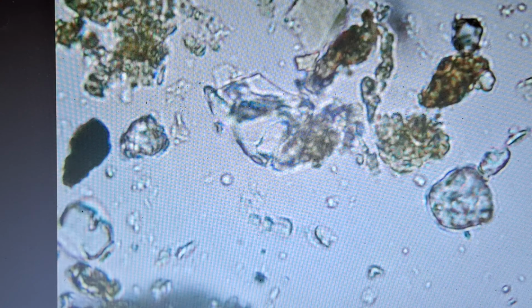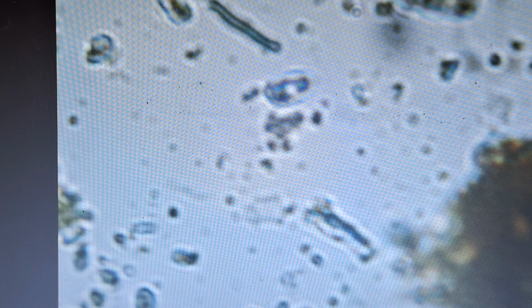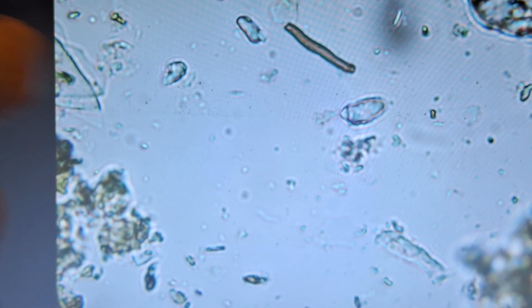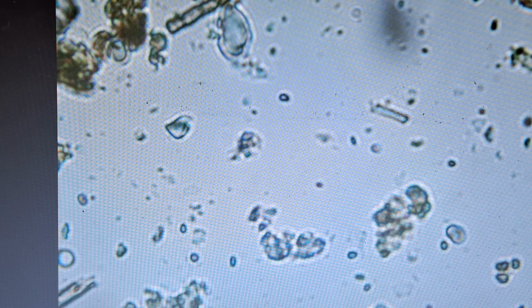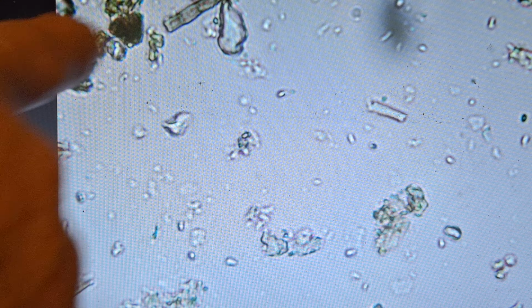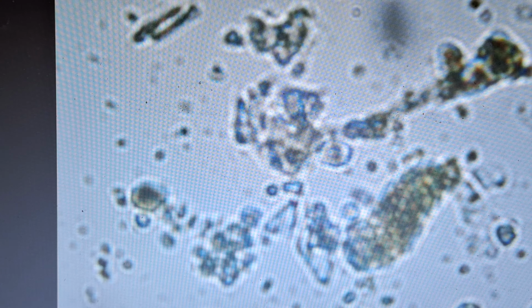We'll look around a little bit and find some fungi, some spores, or some hyphae. There's one right there, I believe. I don't see any septa in it, but I believe that's one that's broken off. It might be an old broken up amoeba next to them. It's hard to compare soil to compost, but my soils do have a lot of compost in them, so we can see all the same players that we should see. There's a nice piece there with the septa in it. So we're seeing everything we want to see here.